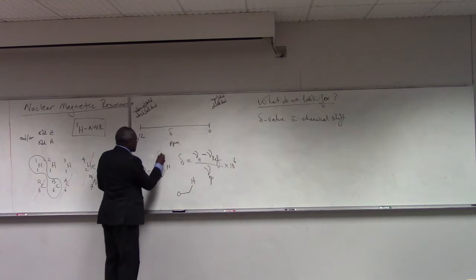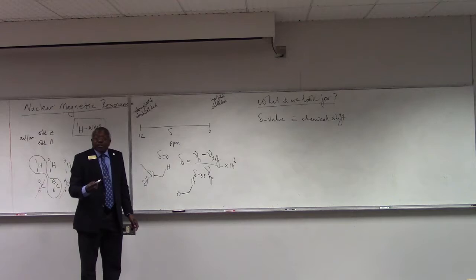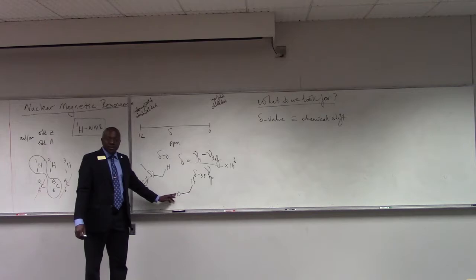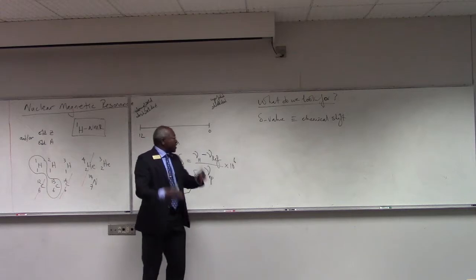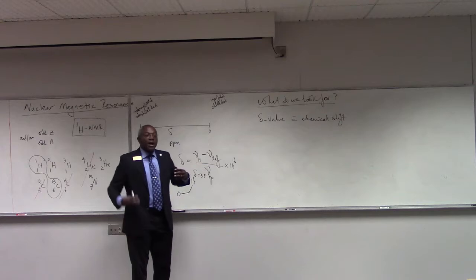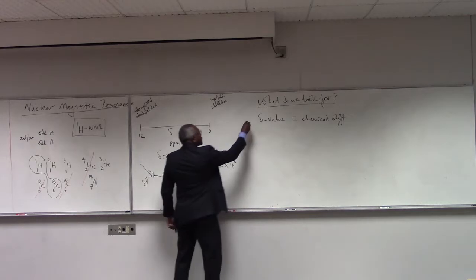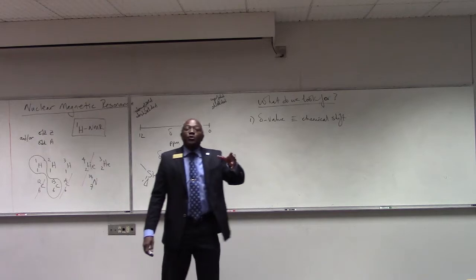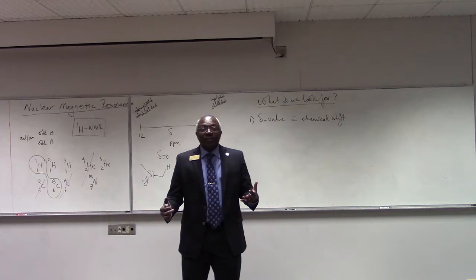So this is a delta of 0. This is a delta of about 3.5. That's a chemical shift, right? The frequency shifted because the chemical environment changed. So my delta value is also called a chemical shift. The shift in frequency caused by a change in the chemical environment of the proton. How shielded it is versus how deshielded it is. So I look for the chemical shift, or the delta value, because that tells me what kinds of groups are in proximity to that H and how many of them there are, right?